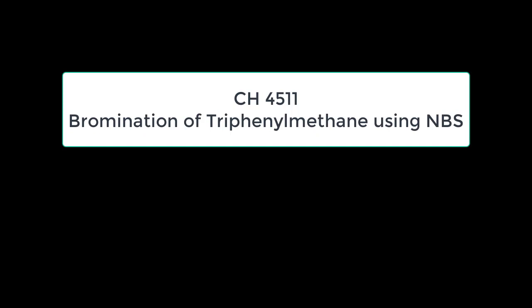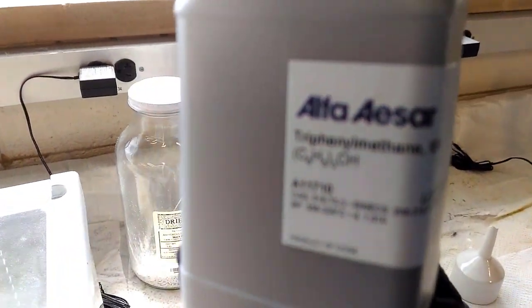The bromine will become radicalized via ambient light, and so it's very important that the round bottom flask we use is clear — not covered with aluminum foil or anything like that.